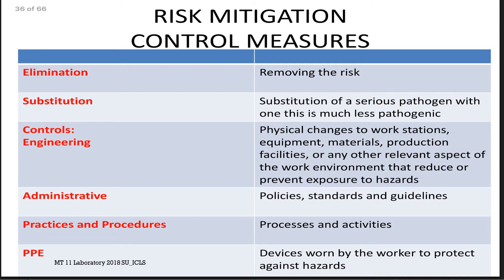Elimination is the most effective mitigation control but the hardest to implement — it involves removing the risk entirely. Substitution involves replacing a serious pathogen with one that is much less pathogenic. Engineering controls involve physical changes in workstations, equipment, materials, or production facilities that reduce or prevent exposure to hazards. Administrative controls pertain to policies, standards, and guidelines set by management. Practices and procedures include processes, activities, or laboratory procedures. PPE refers to devices worn by the worker to protect against hazards — the easiest to implement but the least effective among all mitigation control measures.